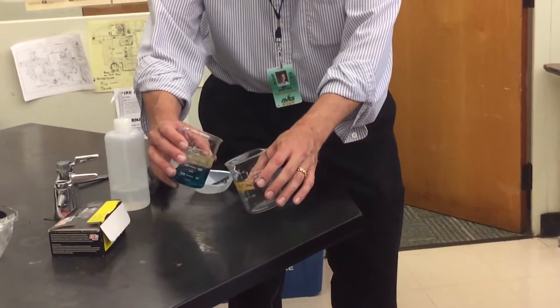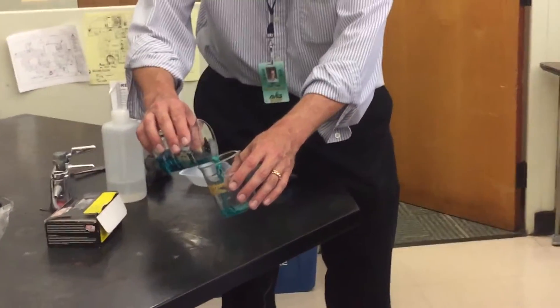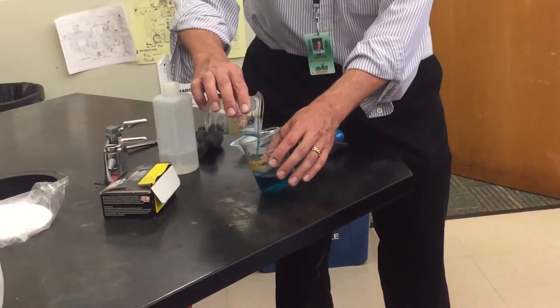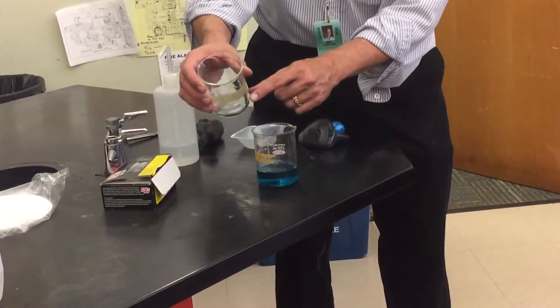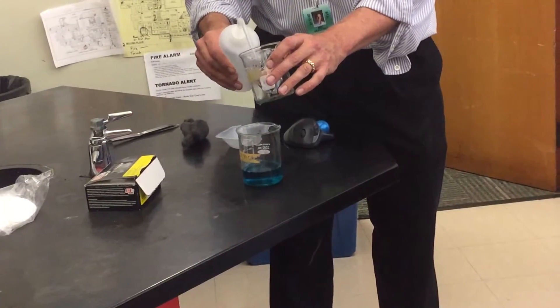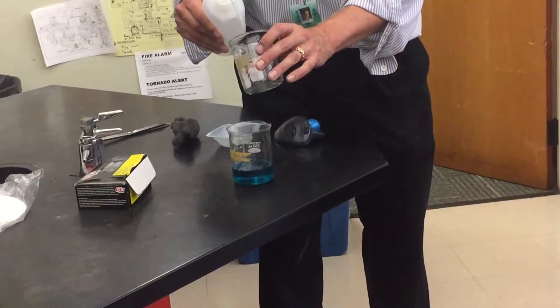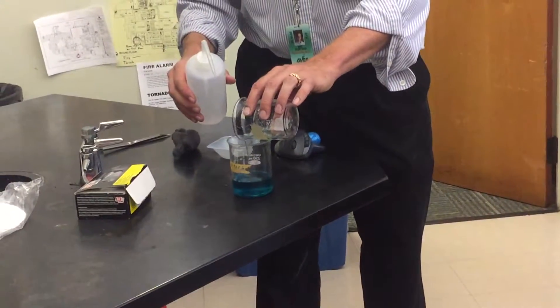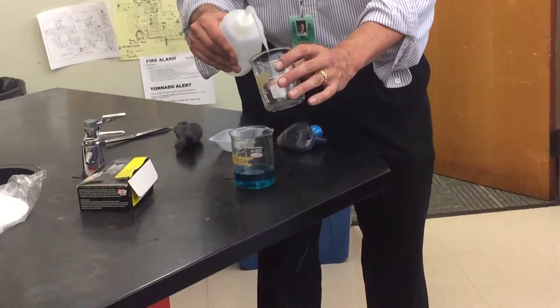Now, to decant means pour off the liquid and save the solid. And then it says to wash, and you can see we've got some brown solid. Now, you'll have a lot more brown solid, so we want to wash this off a couple times. Okay, you just pour off the water, you want to save the solid, we just want to clean off that copper.